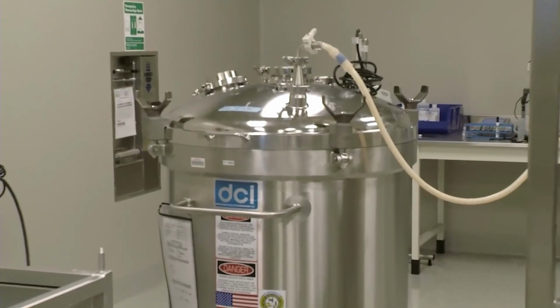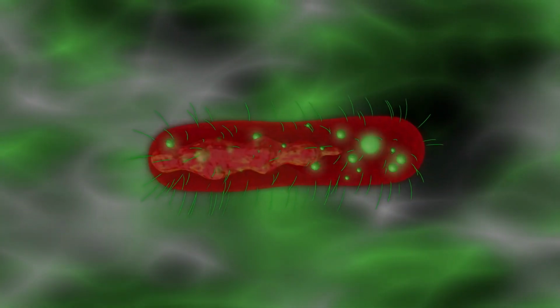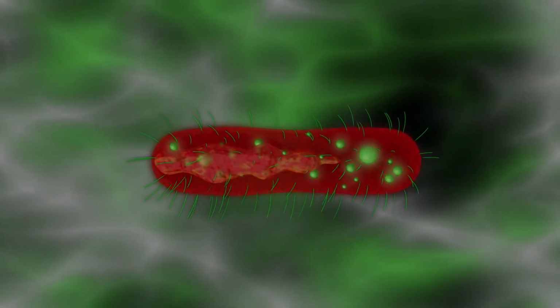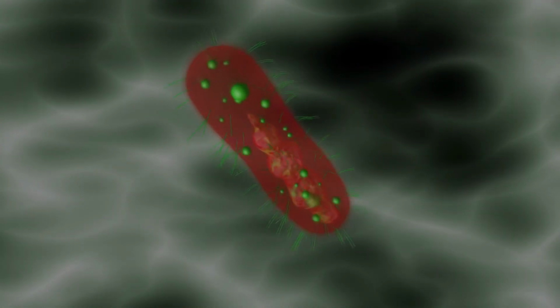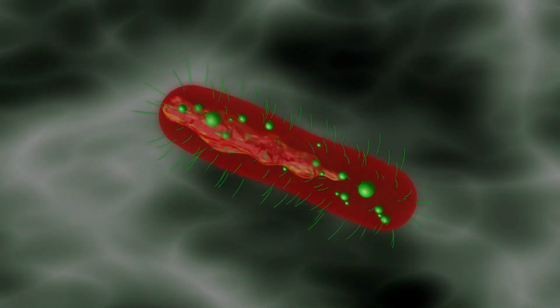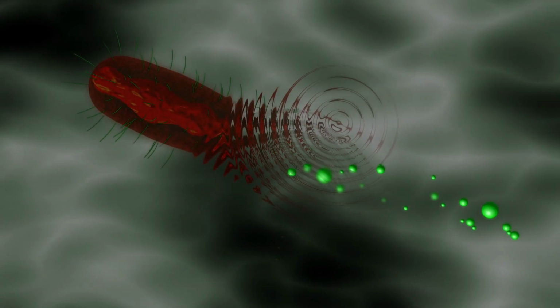The final product of fermentation is called broth. Broth contains the molecule of interest. However, the molecule is still locked inside a host cell, and millions of these host cells are suspended in a pool of depleted media and metabolic waste products. In the next step, recovery, we perform two important functions: separating the cells, solids, from the broth liquid, and separating the molecules of interest from their host cells. Exactly where within the production flow those technologies are employed varies significantly from product to product.